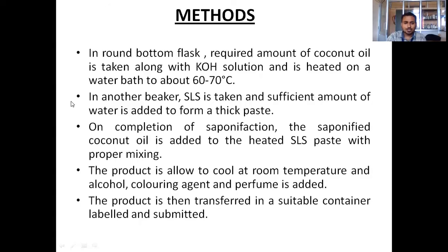In a round bottom flask, the required amount of coconut oil is taken along with the potassium hydroxide solution and heated on a water bath up to 60 to 70 minutes. In another beaker, sodium lauryl sulfate is taken and a sufficient amount of water is added to form a thick paste. On completion of saponification, the saponified coconut oil is added to the heated sodium lauryl sulfate paste with stirring.